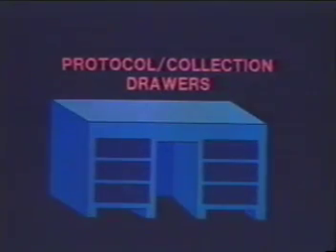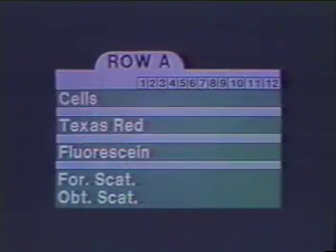In general, for every experiment that you run with FACSDesk, the first step is to create a new protocol. The information you enter for each sample in your protocol is used during the collection process to catalog data. The same information is also used to appropriately label each integration, histogram, and contour map that you request when analyzing your experimental results.